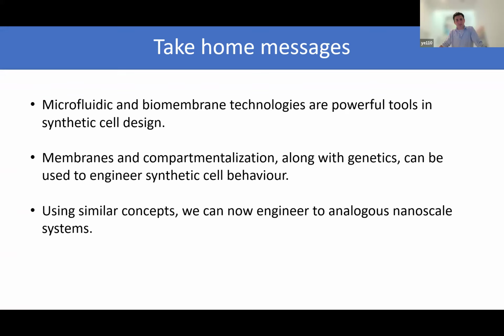The first is, I haven't spoken a lot about the intricacies of the devices. We have some fairly intricate devices now, which allow us to do everything that I presented. But both microfluidics and biomembrane technologies are really powerful tools in synthetic cell design. So many of you work with gene circuits and genetic constructs. Those are very useful, but membranes themselves can also be very useful systems which we could engineer to give us synthetic cells functionality.